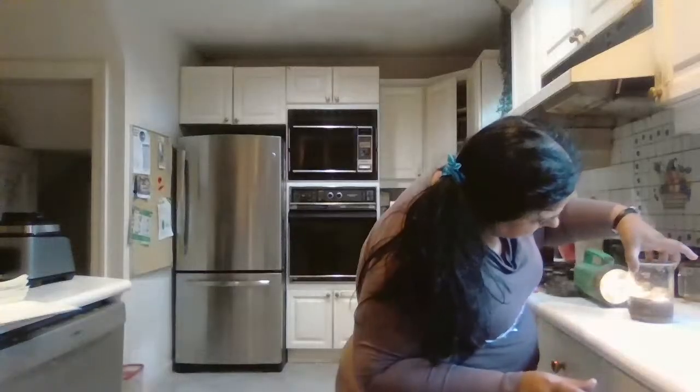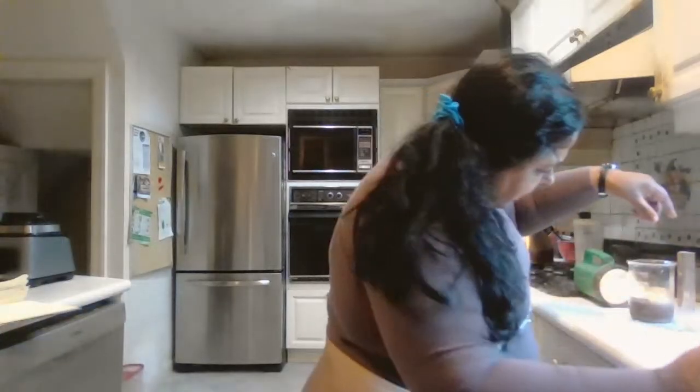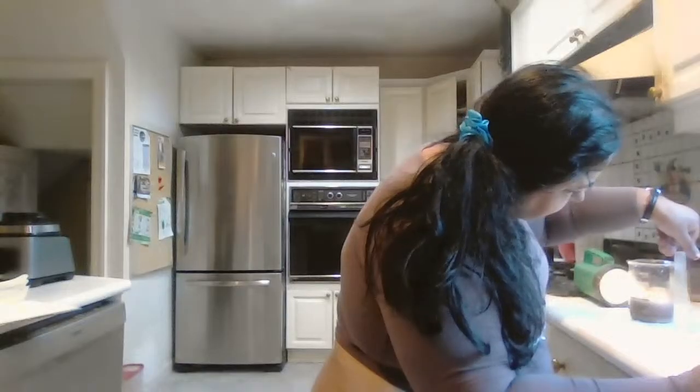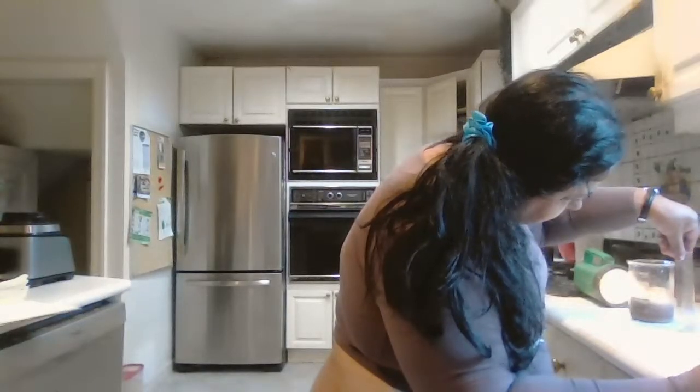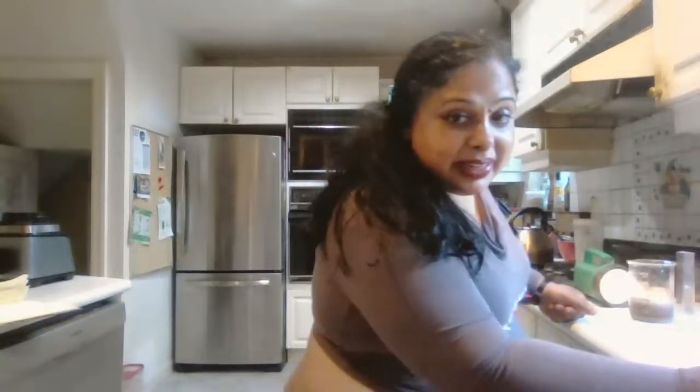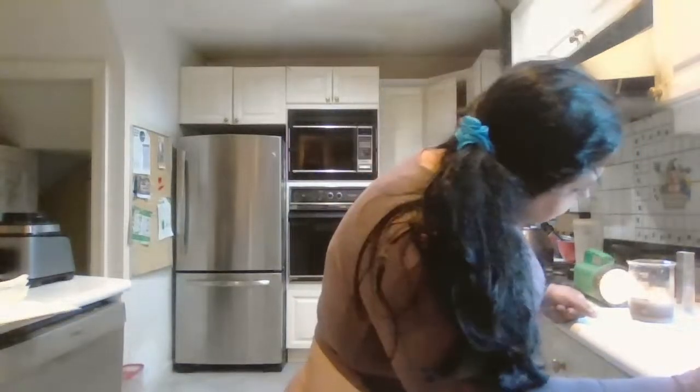it all comes out. This is violet, and maybe it was a little too much copper. Some of it is excess. Give me the same result, God. God, listen.